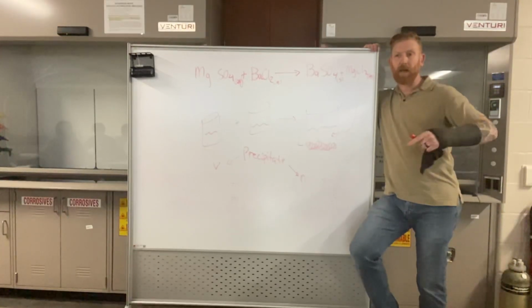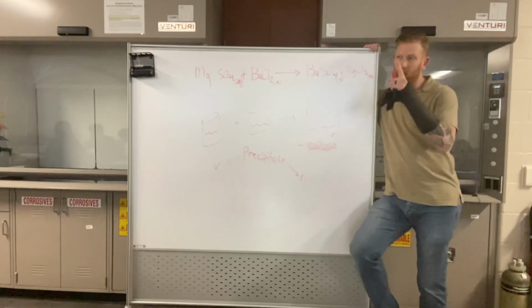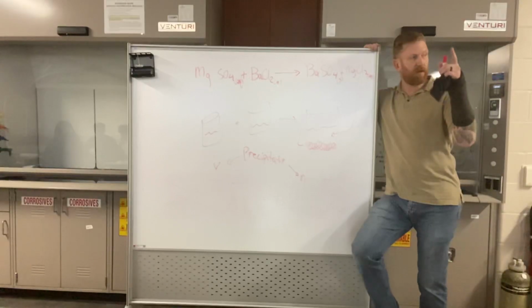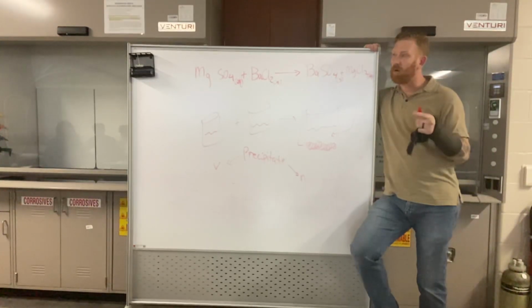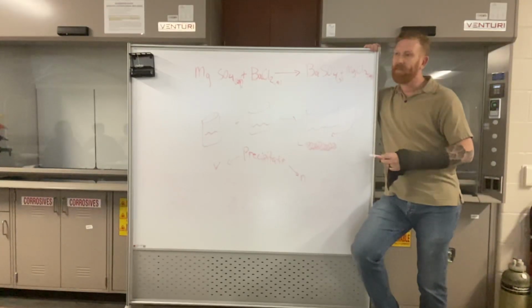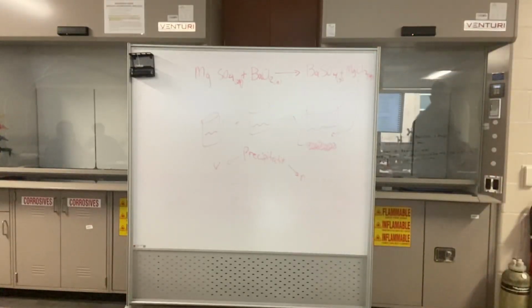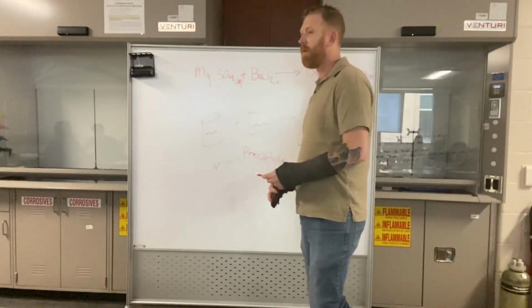Then we're going to get a sense for what the precipitate looks like. And then you're going to have an unknown. You're going to mix those together, and you're going to use these solubility tables like Sherlock Holmes over here, and you're going to deduce what your unknown is. How do you know just by looking at a balanced equation if something will precipitate or not? Is it just by memorizing this table?